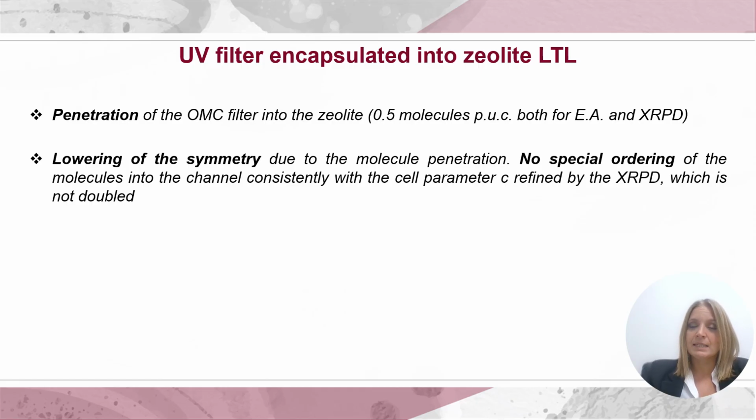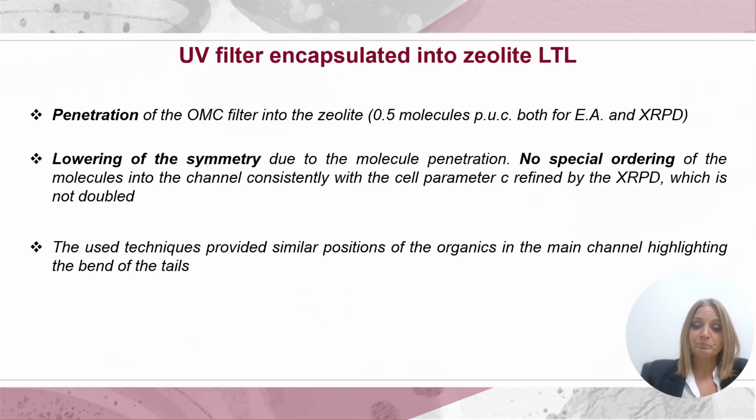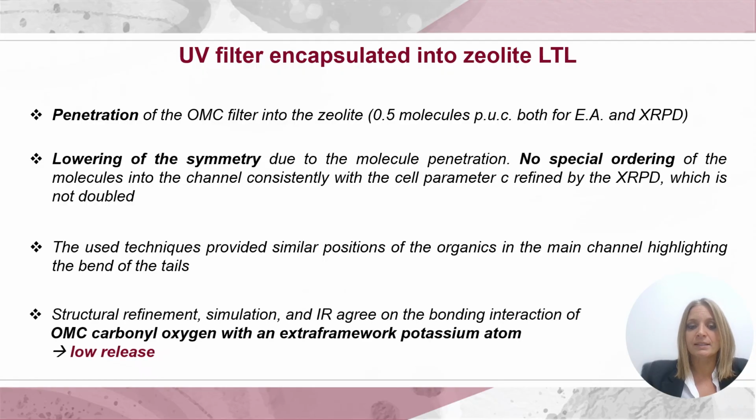We didn't notice any special ordering of the molecules, but we were able to see the number of molecules inside the porosities, and especially the link between the molecules and the zeolite, which obviously has a really high impact on the application of these hybrid materials.